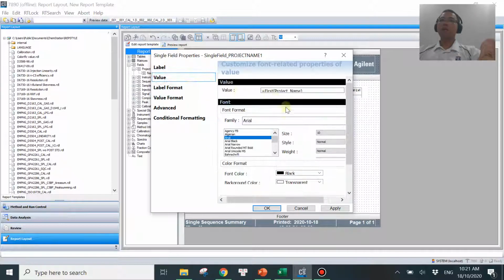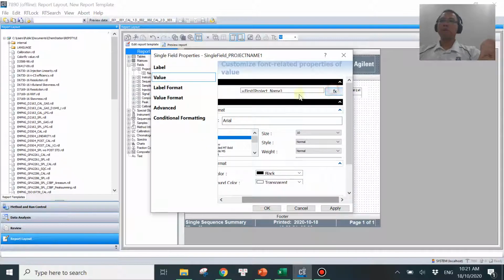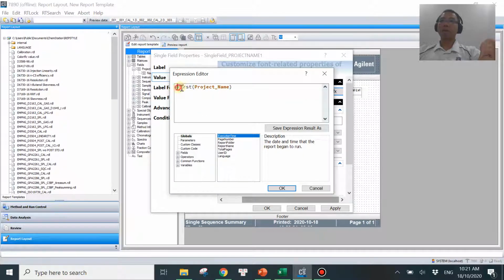Then in another value over here, because we know the formula we are using right here is 3 times the standard deviation, delete the formula from here, go to variables, and you have the standard deviation down here. So that will be 3 times the standard deviation.